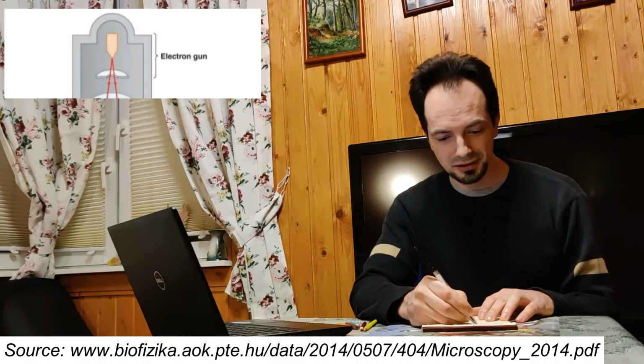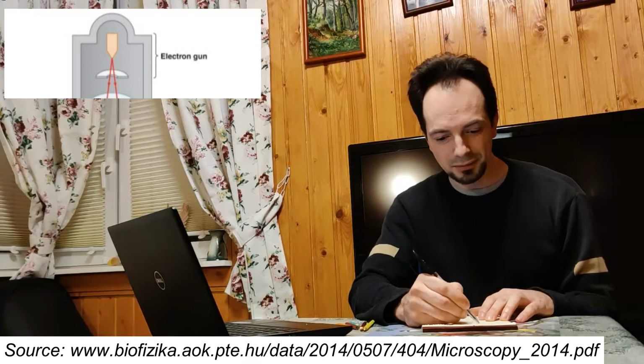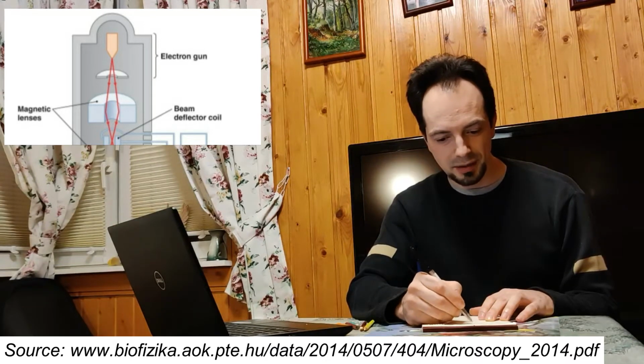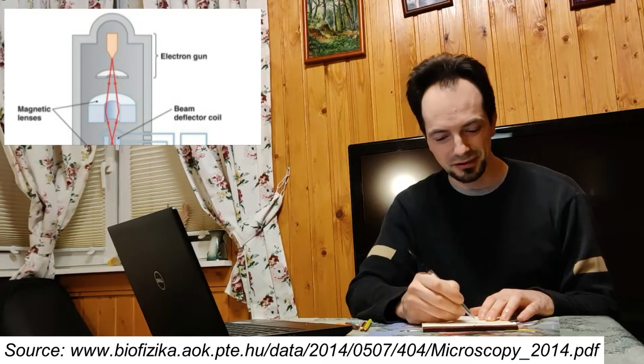I will now try to show you the basic scheme of the apparatus itself, the basic components of the microscope. So let's draw them here. To start an electron beam, we need an electron gun. The main element of the electron gun is a cathode. We will talk about cathodes on the next slide, but as for now, the cathode is the start. Then we need some kind of preliminary accelerating system for the beam. That's where the beam starts. Then we need some kind of focusing system and apertures in order to form the beam.